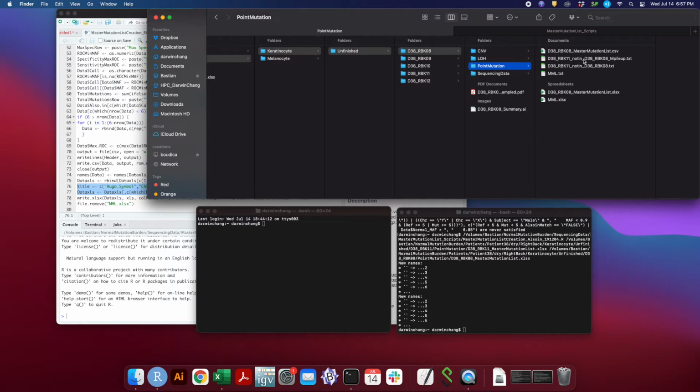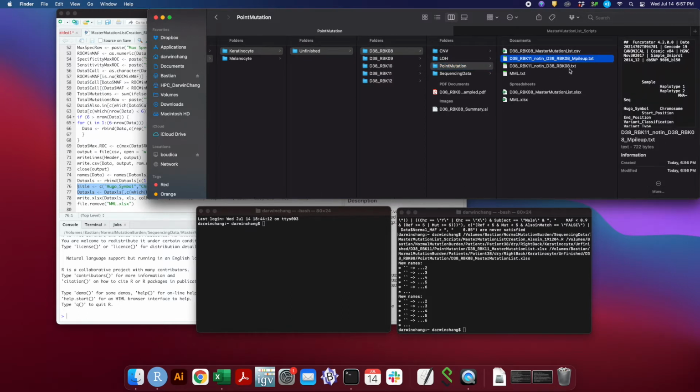We want to use the mpileUp text output as our input for the next script, as sometimes there are DNPs, or dual nucleotide polymorphisms, which MPileup cannot handle. MPileup can only handle single nucleotide polymorphisms. So my script translates the first of the two DNP points, base pairs.